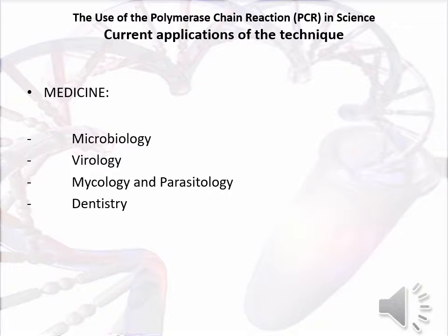Dentistry. Polymerase chain reaction is a standard diagnostic and research tool in dentistry. The polymerase chain reaction allows for the diagnosis of infectious microbes resulting in maxillofacial infections. It can also assist in the effective management of periodontal disease, endodontic infections, and oral cancer.